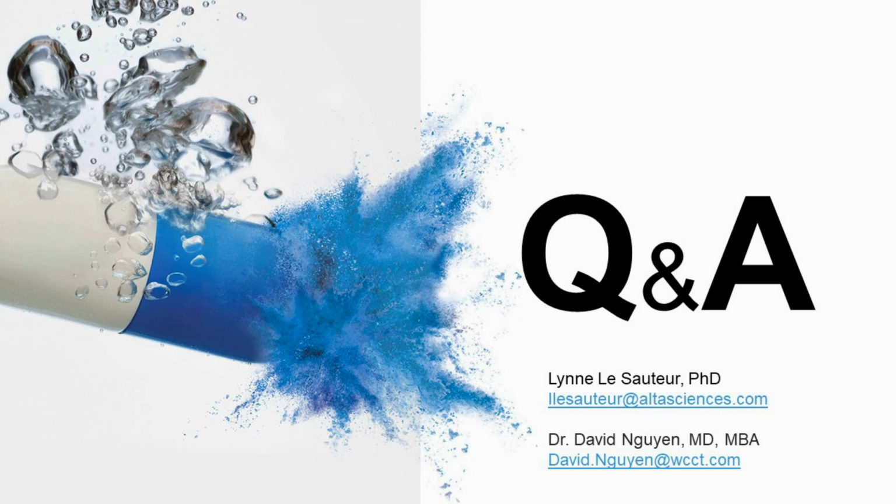So that can help to mitigate that. And then really the PBMC cell isolation harvesting that occurs in these trials requires a lot of technical expertise on the collection side. So a team of phlebotomists that are trained, that are familiar with the number of tubes, the volume of blood that needs to be collected, and then having an on-site cell isolation lab to prepare the samples properly and extract them for shipment to go to a bioanalytical lab is really critical. And we enjoy that here at Altasciences because of the work we do and how often we do it, that the teams are familiar enough with this process to make it successful.